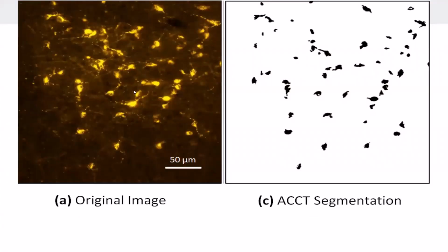So this figure depicts an image taken from the FluoCell dataset before and after segmentation. The cells in the original image are indicated by the bright yellow fluorescent colors, and the resulting segmentation depicts where a certain classifier thought cell pixels are located and thus where cells are.